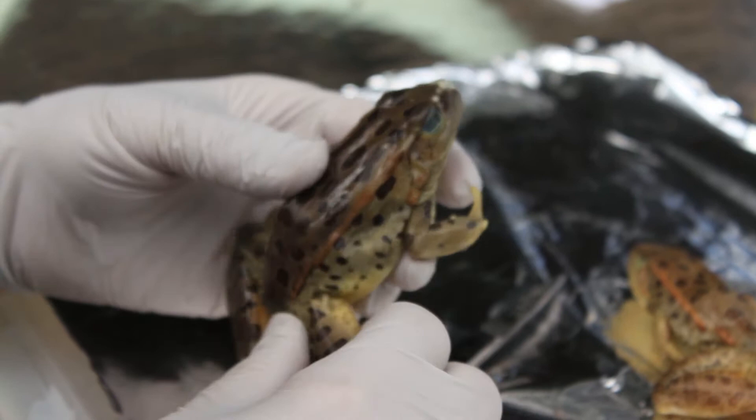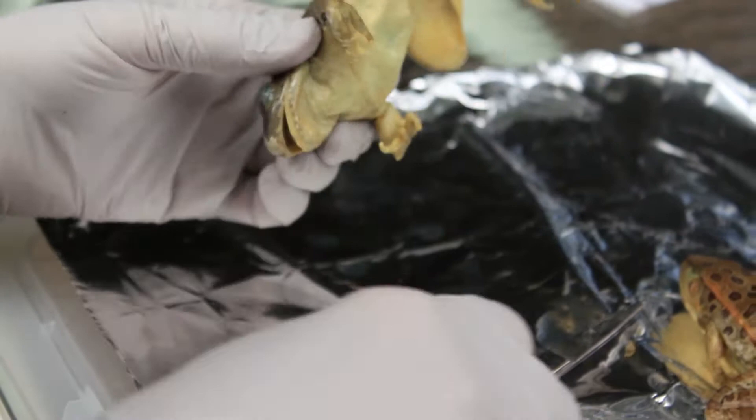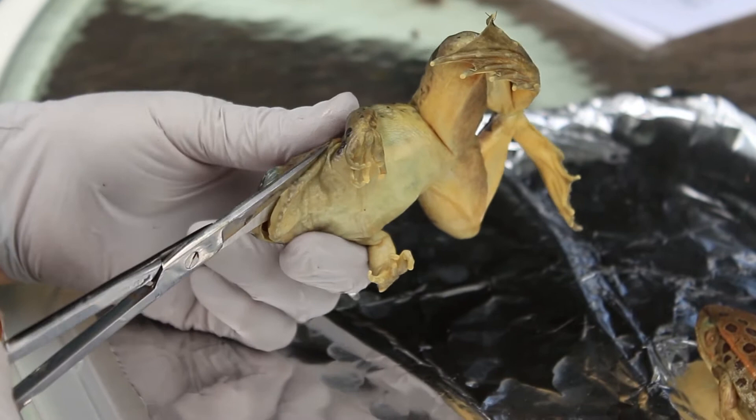The tympanic membrane leads into the mouth like our ears do, and there's a tube there called the Eustachian tube. One thing about the frog — if we open up his mouth here, you can see it has a tongue. We're going to have to cut it open a little bit, and it might gross you out a little bit, but we'll do the best we can.